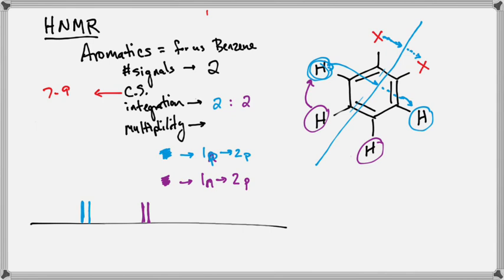Okay. So cool. If I had an aromatic ring with two identical substituents, I get this peak patterning. Okay? The separation of those peaks away from each other is going to depend upon the identity of those X's and the strength of our individual magnet to decide how far apart they're going to go. I would argue in this case, blue is closer to the X than the purple. So the blue should be significantly different from the purple and they shouldn't be merging and overlapping.